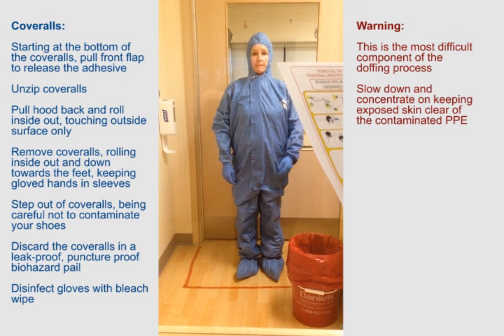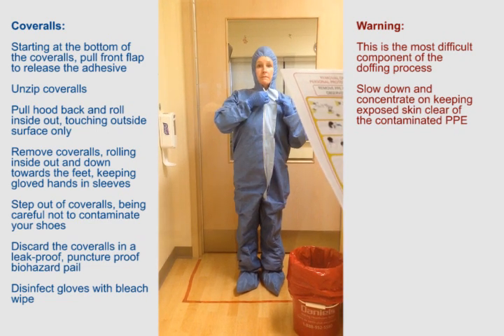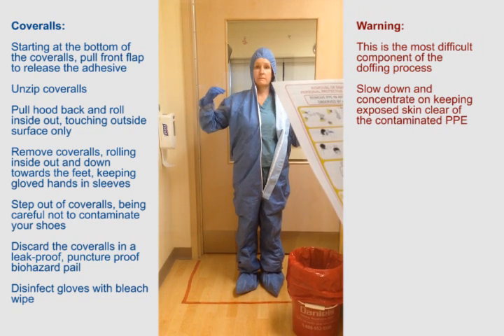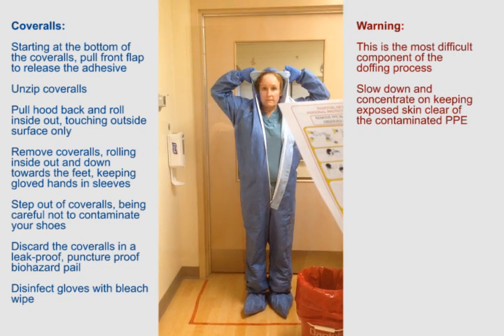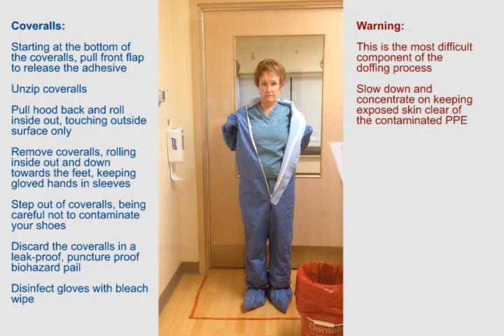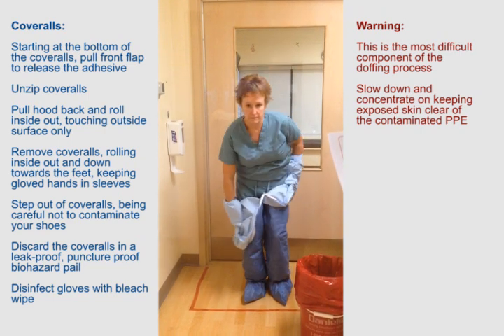Coveralls. Starting at the bottom of the coveralls, pull front flap to release the adhesive. Unzip coveralls. Pull hood back and roll inside out, touching outside surface only. Remove coveralls, rolling inside out, down towards the feet, keeping gloved hands in sleeves.